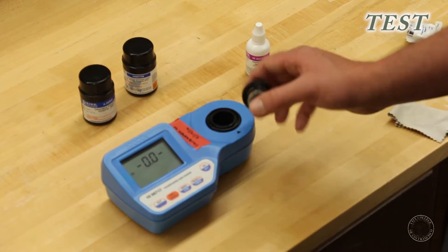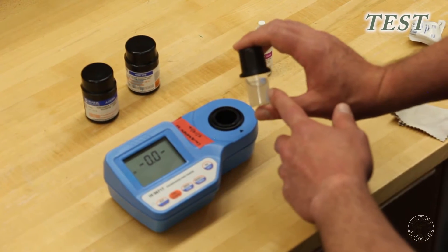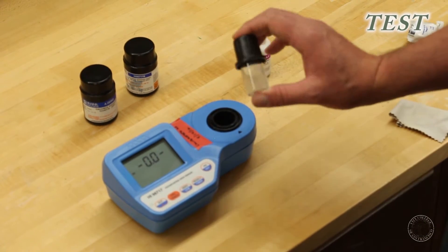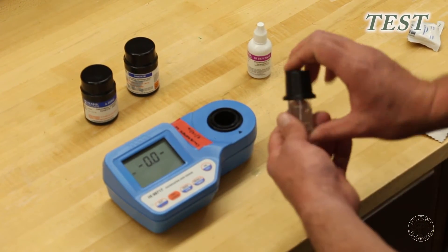And you'll be able to tell instantly if you do have any phosphates, because this will start to turn a pinkish red color. But this is drinking water, so it's good to see nothing changing.